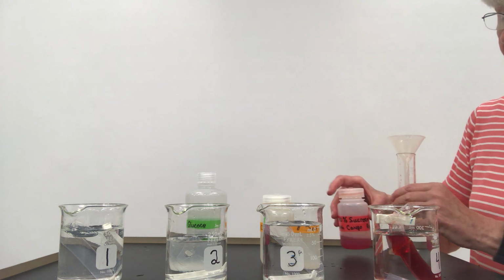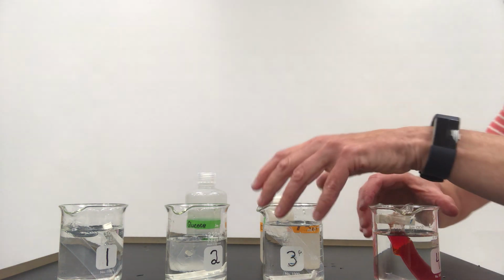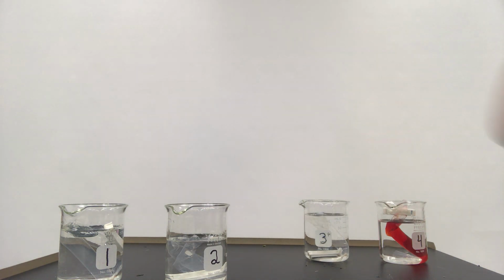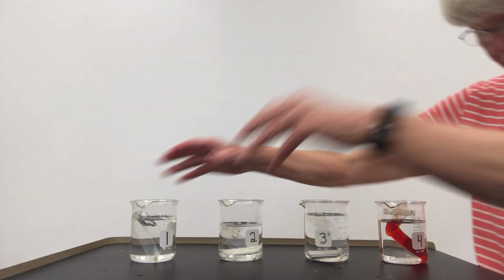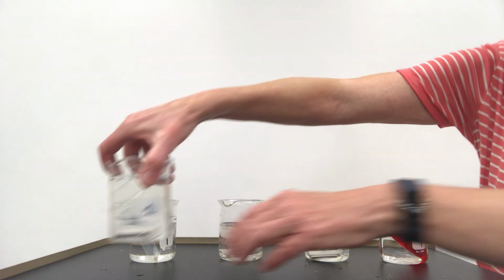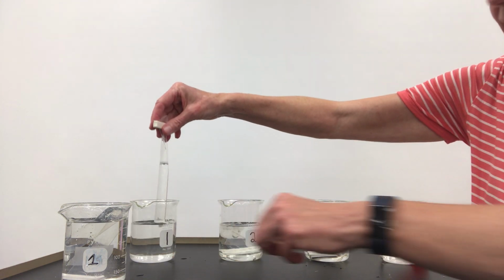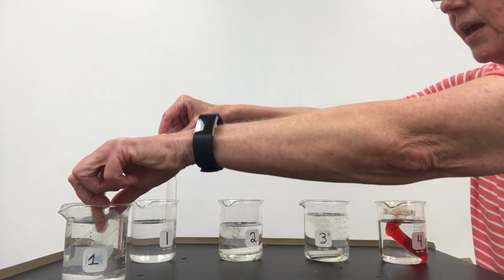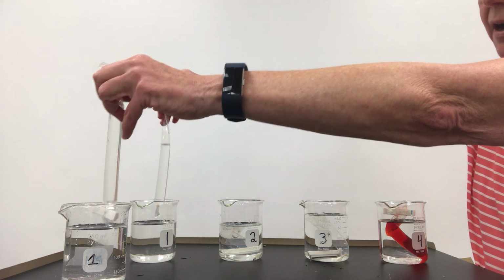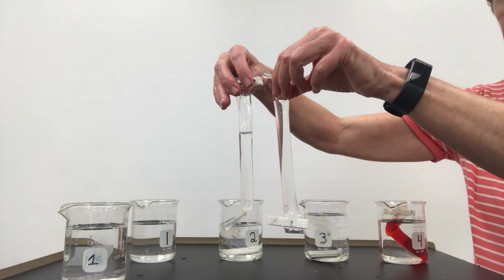And then at the end of that hour and a half, we would retrieve our beakers, and we have done so here. We're going to show you the end results, and we're going to look at the different beakers and the different solutions. Now, in beaker 1, after it's run for an hour and a half, it started out flaccid and limp, but at the end, it has gained much more water, and because it is a hypotonic solution and the water has been able to move into the sac, it has gained weight.